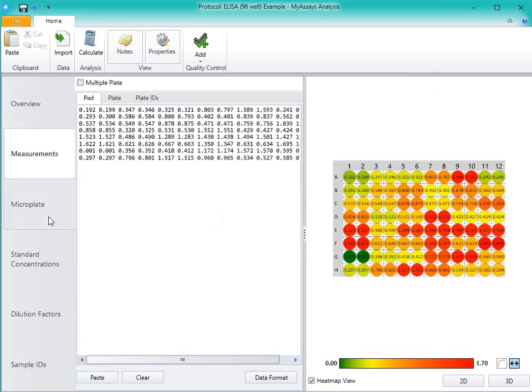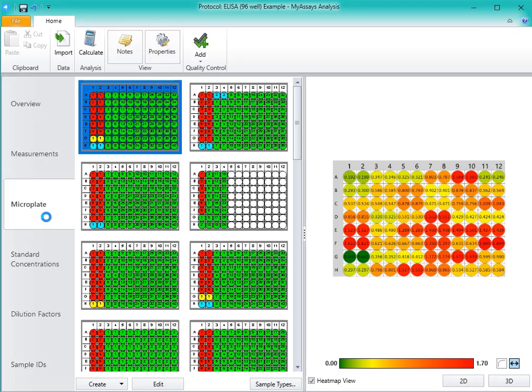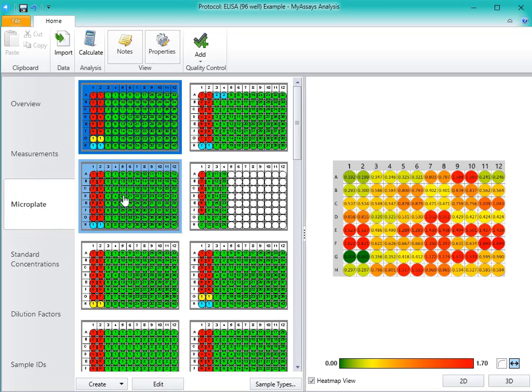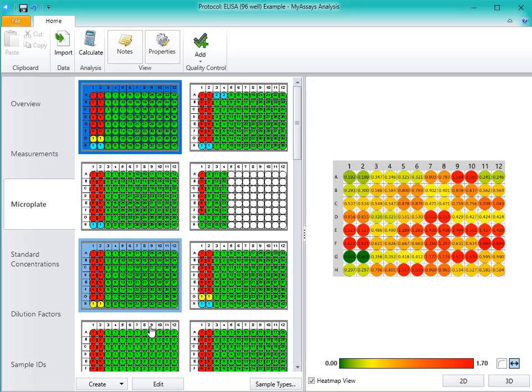Under the Microplate tab, you can select a plate layout that matches your assay. If a matching template is not available, you can choose to edit an existing layout or to create a new layout.